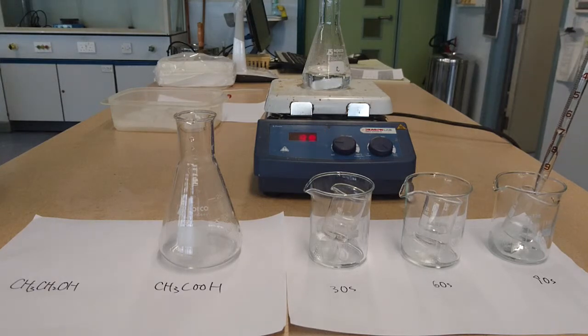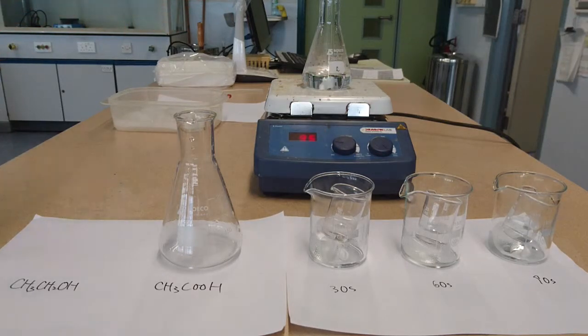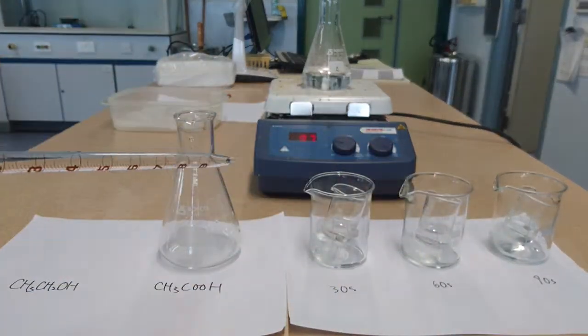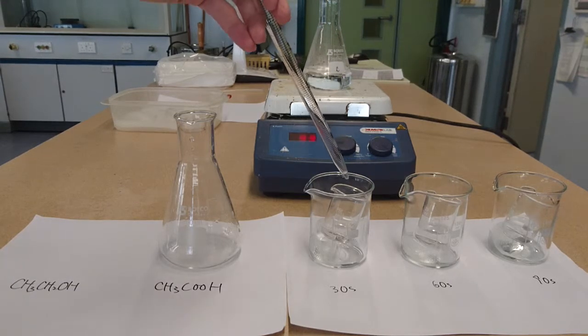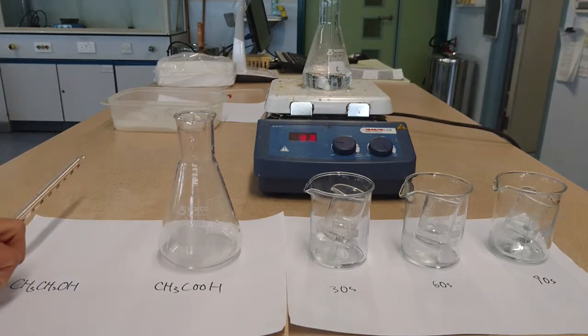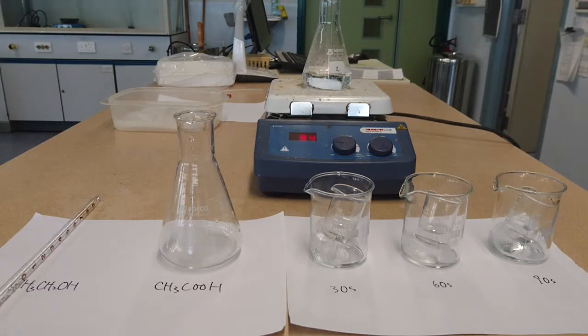So what's happening here is that you can see the original reactant keeps on reacting. However, at 30 seconds, 60 seconds, and 90 seconds, the reaction is halted at this point. And we can follow the progress of this reaction by determining the amount of acid left inside this beaker, and then this beaker. And then we can follow the rate of reaction of this progress.